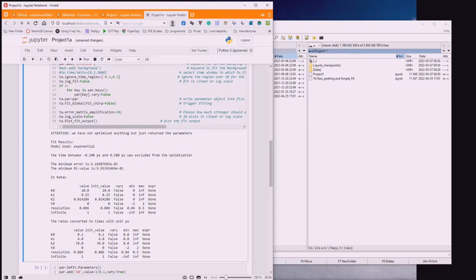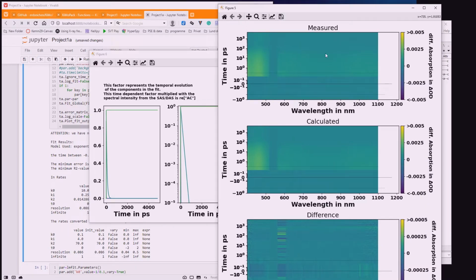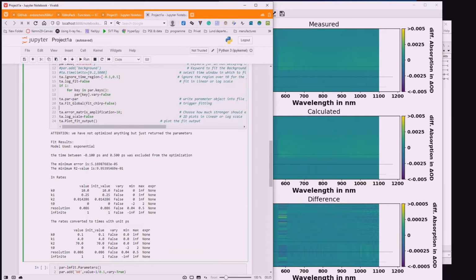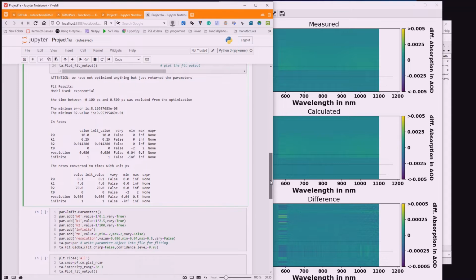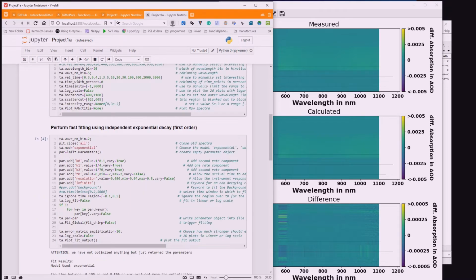But what I do is I calculate the spectra. So in my matrix, I have my measured, I have my calculated matrix, and in here you see that 10 times the difference is actually not too bad. I also recognize, okay, this plot is not very good. I don't see enough contrast. So I would usually change my color scheme. And there's a number of color schemes one can use for that, depending on what you want to achieve. But for example, I usually use a lot of jet.